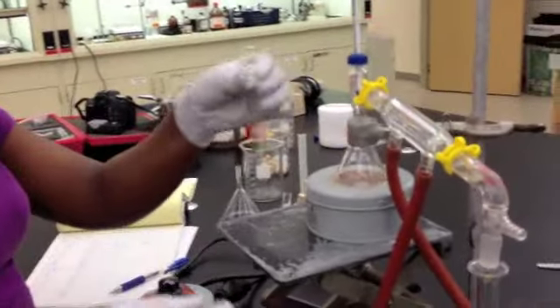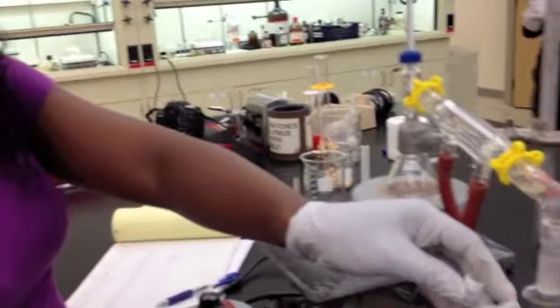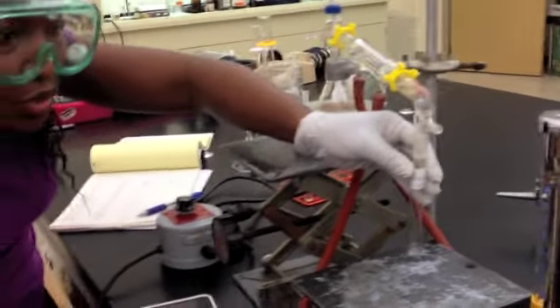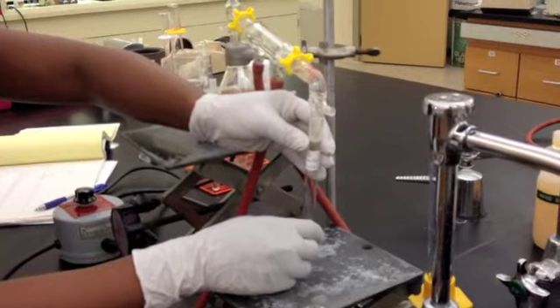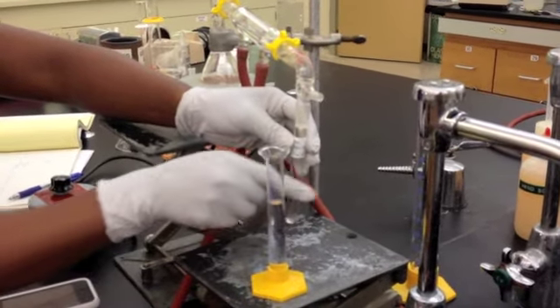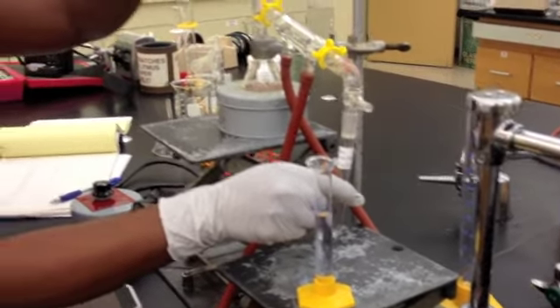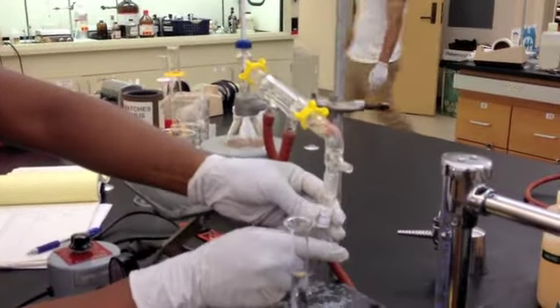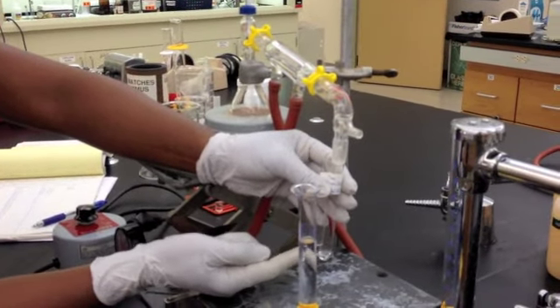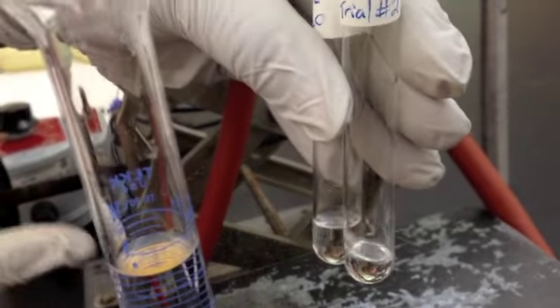During simple distillation, you're going to collect fractions at designated volumes. Now I'm collecting the 17th fraction. At this point, you'll remove your graduated cylinder and use another pre-measured amount for 1 milliliter with your empty test tube to collect the 1 milliliter of solution. So this is the 17th fraction. Make sure your test tubes are pre-labeled, and you'll slowly collect 1 milliliter.